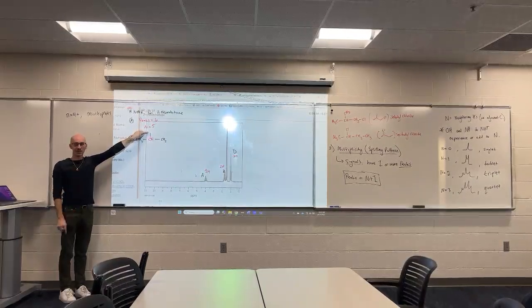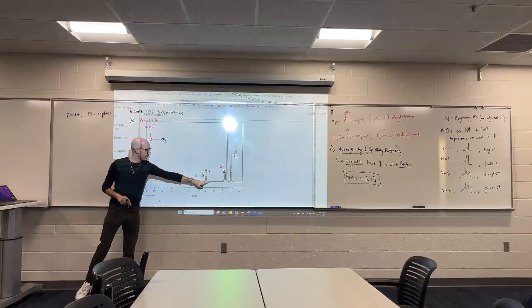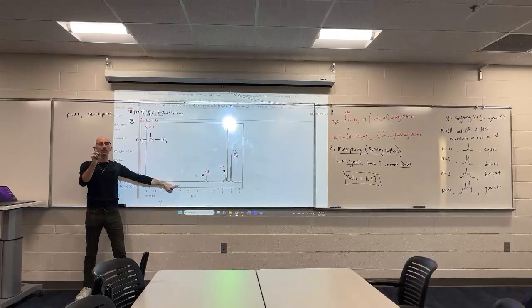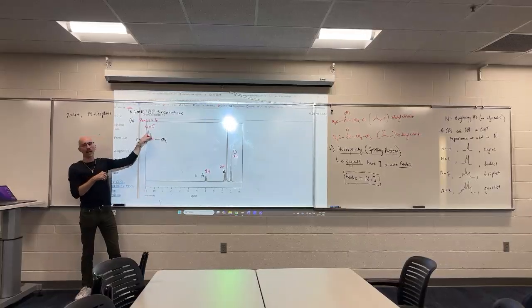And because we know the chemical formula, we know it's the chlorine, but also we know something more. What goes here has to be, actually not anything but a chlorine. We need to add anything but a hydrogen and a carbon group with hydrogens, because that would add more neighbors.